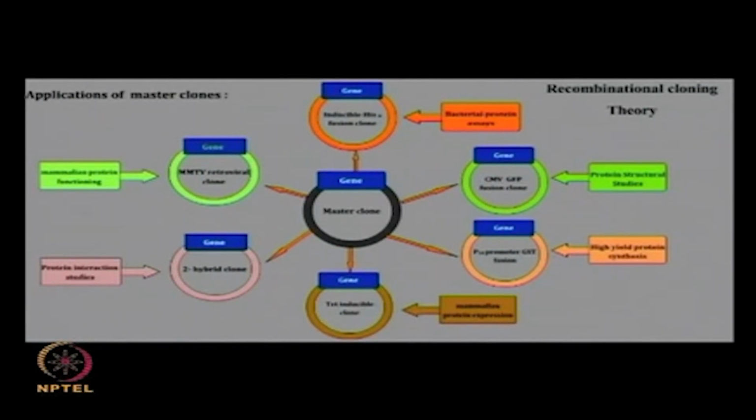Proteins can be efficiently expressed in bacterial, yeast and mammalian systems and used for a variety of applications such as structural and functional studies, protein interaction studies, protein assays, and producing high yields of protein for experimentation. The rapid recombination between clones that is possible with the Gateway system cannot be done using conventional cloning techniques, due to which this recombinational cloning protocol is now widely used.